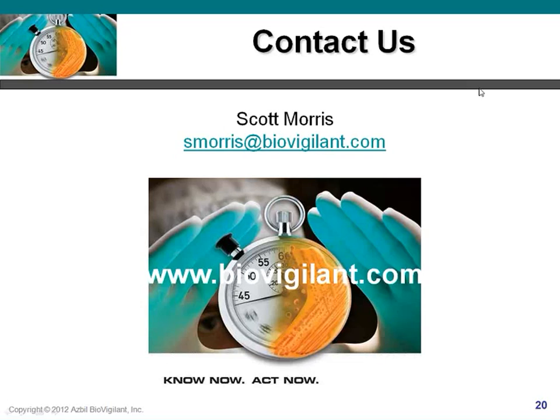But implementing parametric release, of course, is kind of a broad endeavor. The IMDA system alone couldn't help you achieve parametric release. It's a whole suite of technologies and methods that once implemented give you that holistic picture of what your process is doing and ensure that your process is under control.